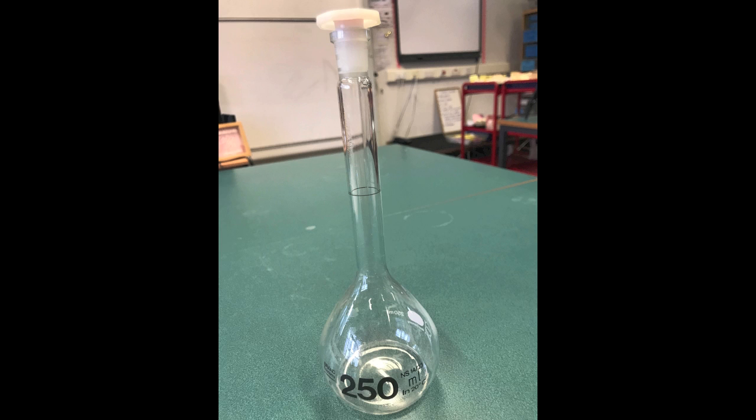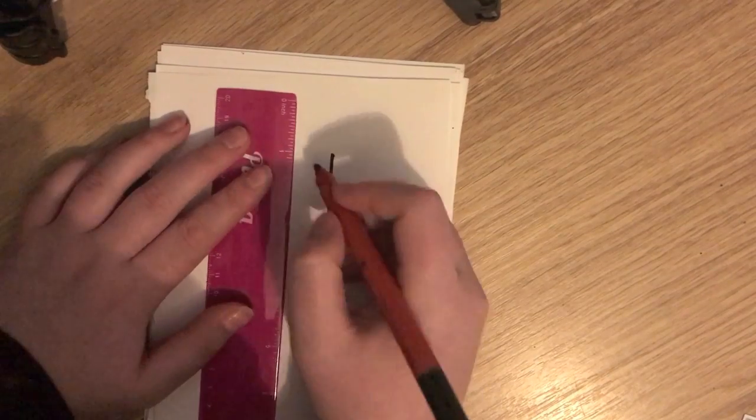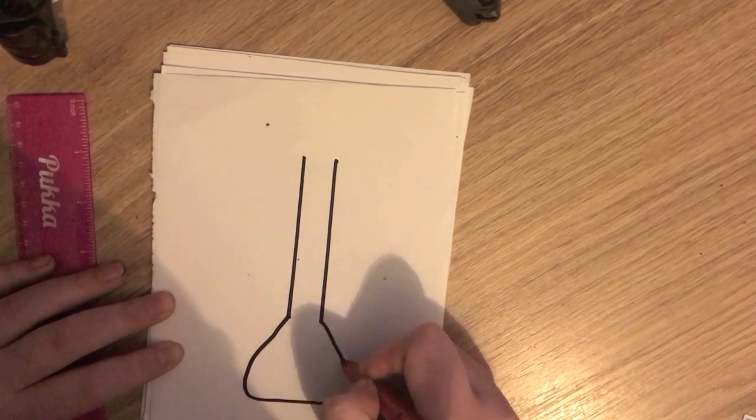Standard or volumetric flasks can only measure one volume of liquid and are used to make standard solutions, those with a known concentration. The volume of the flask is shown by the graduated line on the neck.